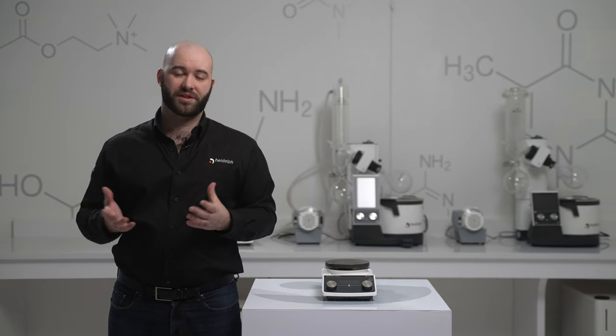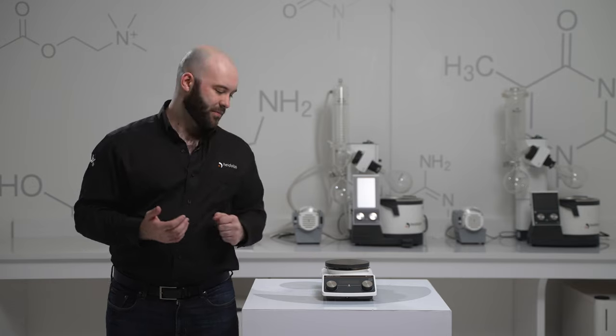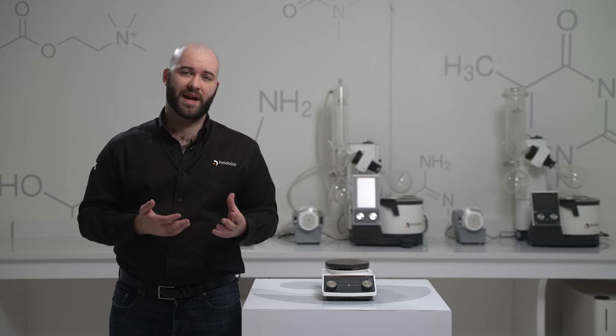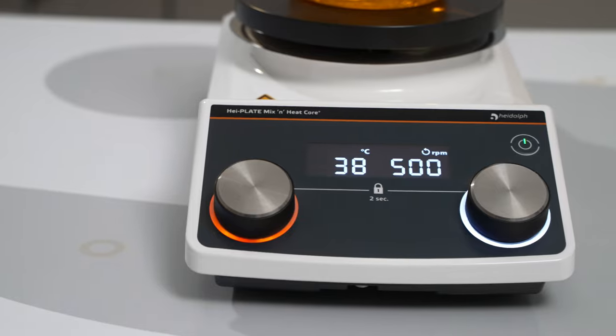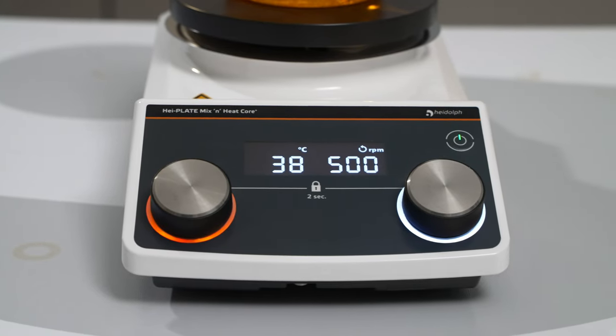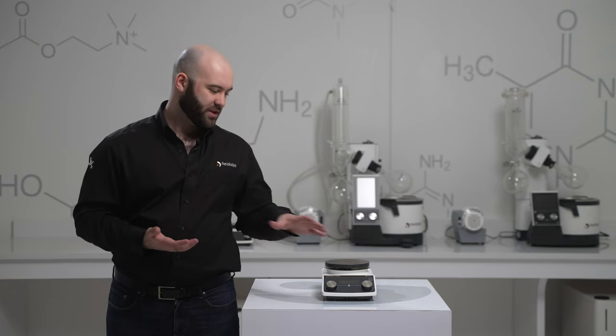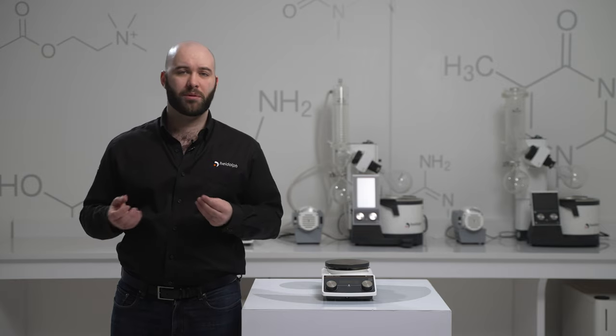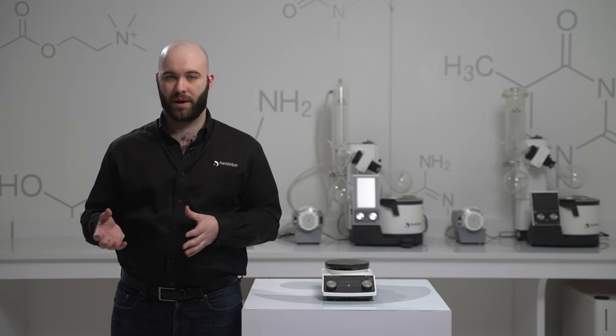The third hotplate to receive the update is the hotplate mix and heat core plus. This hotplate is replacing the high tech. Big change here is that we now have two knobs—one for stirring and one for heating. This provides additional control and a bit more ease of use when it comes to changing your parameters.